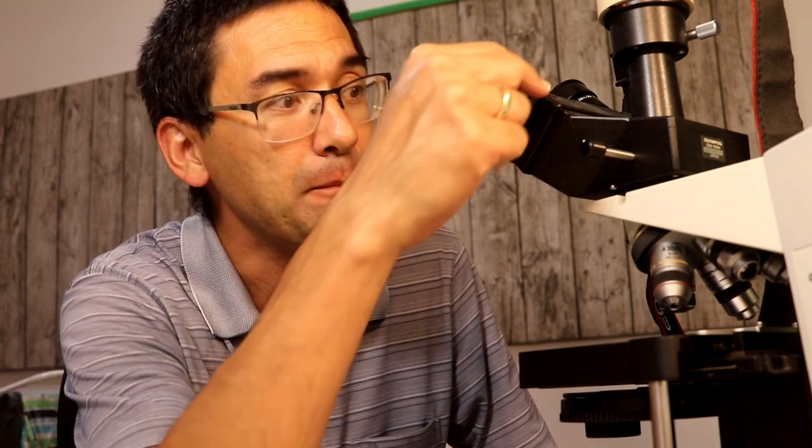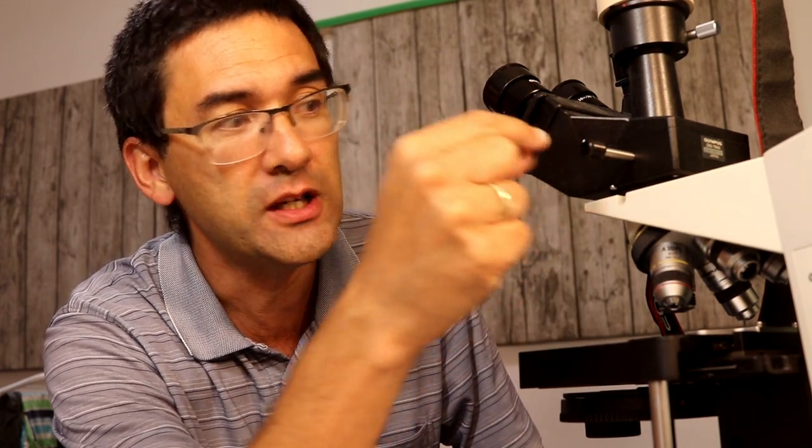Many of these microscopes these days are so-called infinity microscopes, which allow you to add additional elements into the tube here before the light reaches the eyepiece. There's usually a slot where you can add additional elements, and this also increases the price. So I think what you need here is a low-cost polarization microscope with just the bare features, and I'm worried that's going to be difficult to get.